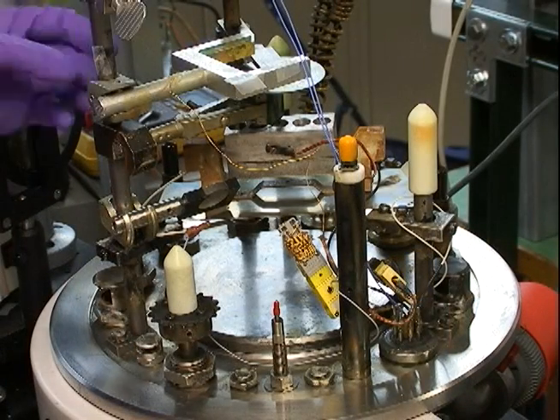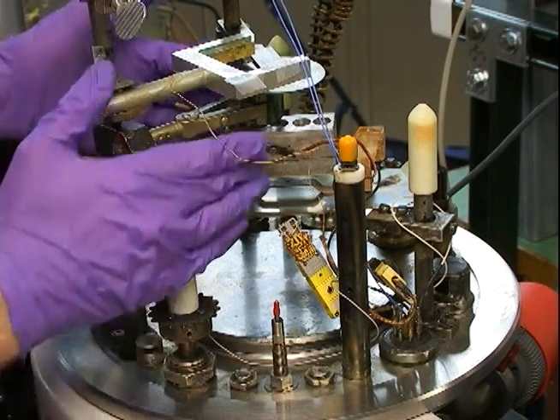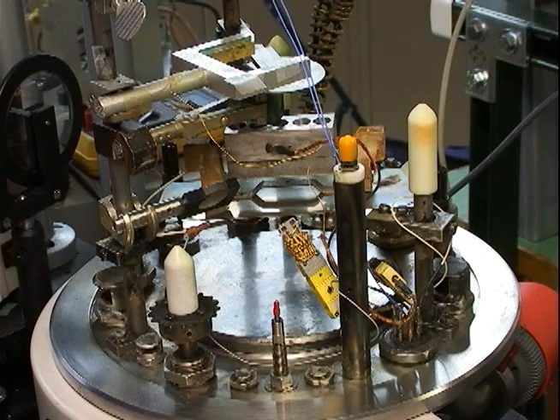Above that, there has to be some sort of guide to take your sample and then when it turns into a vapor, get it to the substrate without it running wild around the bell jar.